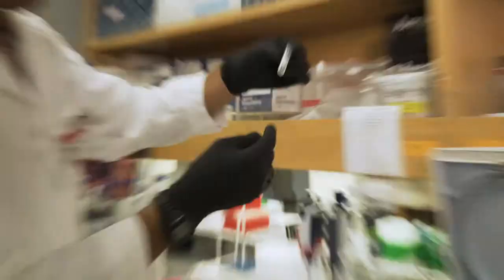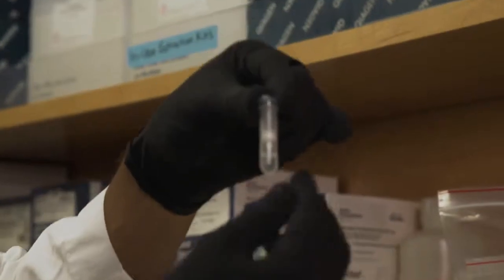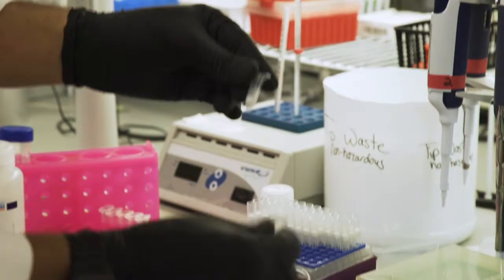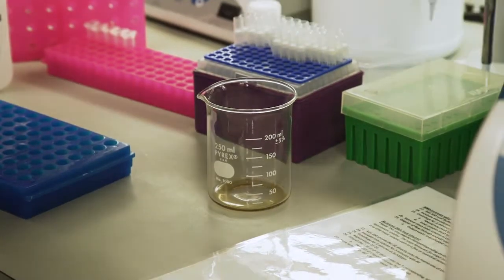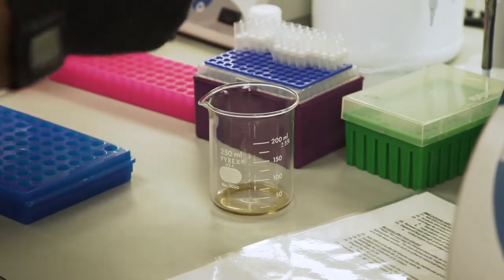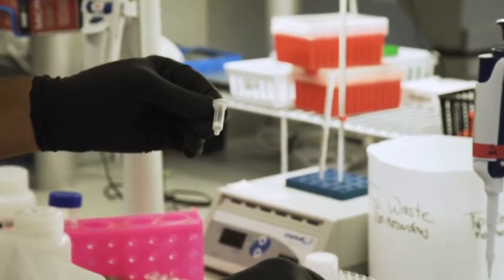Now this time, since we're removing mainly just small things that you can't see, that's why it looks like mostly water. Like, oh, you don't see anything there. Well, unfortunately, you can't see most of the things we work with. You aren't going to visually see the long chains of DNA. So for now, we just have to believe that they're in there. But at the end of this, we'll be using a machine called a spectrometer that lets us see how much DNA is in there, and also helps us check if there are any contaminants.